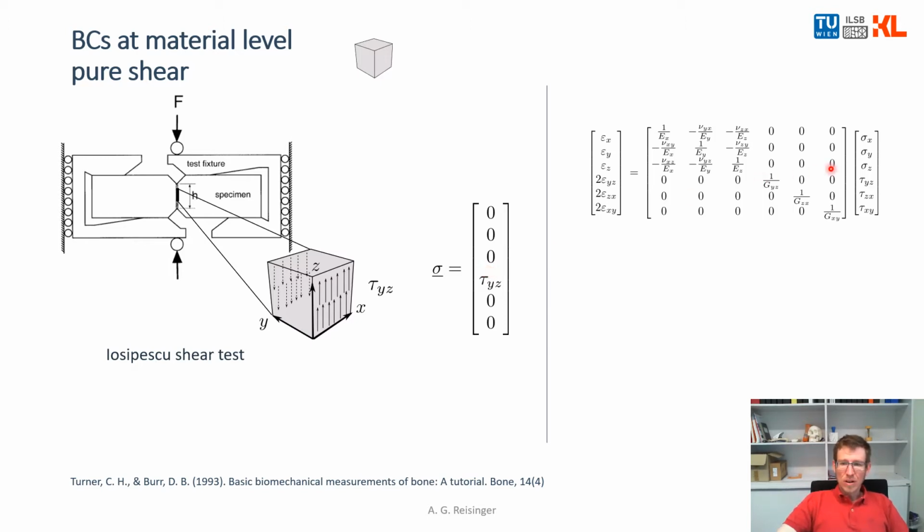When you then go into your material law, this is again simplified to one equation, coming from this line here. And you know the shear stress. And when you do optical measurement or other methods, you measure the shear strain, then you can calculate your shear modulus here, G_yz.